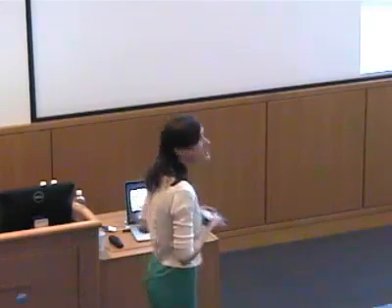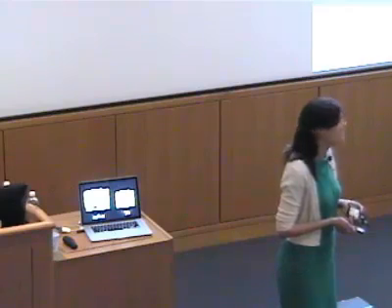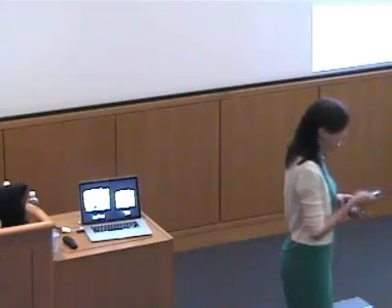So as Karsten told you, today I'm going to tell you about X-ray spectroscopy. I'm going to primarily focus on X-ray absorption spectroscopy, which is probably the better-known method, particularly in bioinorganic spectroscopy. And then towards the end of my talk, I'll talk a little bit about X-ray emission spectroscopy, which is an area that's particularly close to my heart and that my group has had a lot of activity in the last few years.